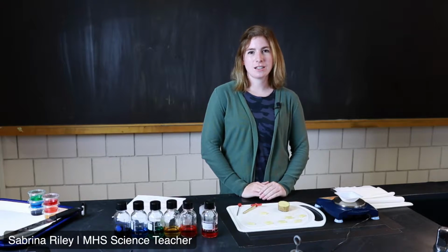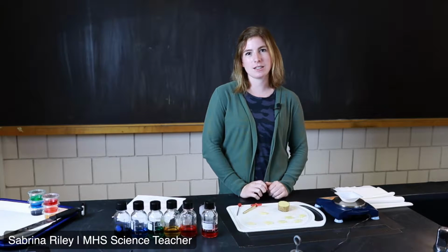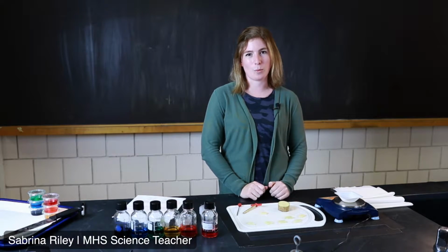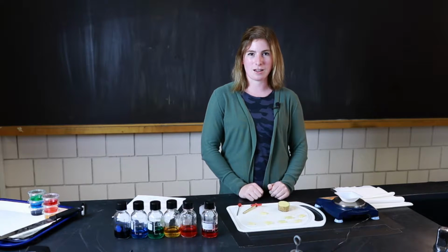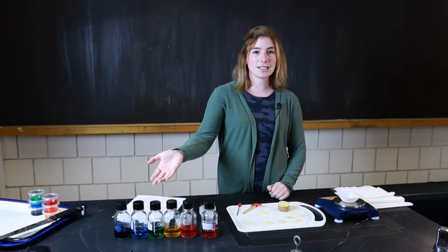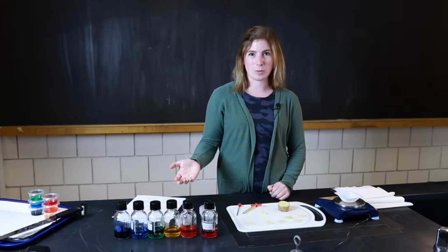All right. So today we're going to be doing the Solving Mystery Molarities using Principles of Osmosis lab. To get us started, I'll give you a little background information and then we'll jump into the procedure. I've made 6 different sucrose solutions here. They are of different varying molarities.